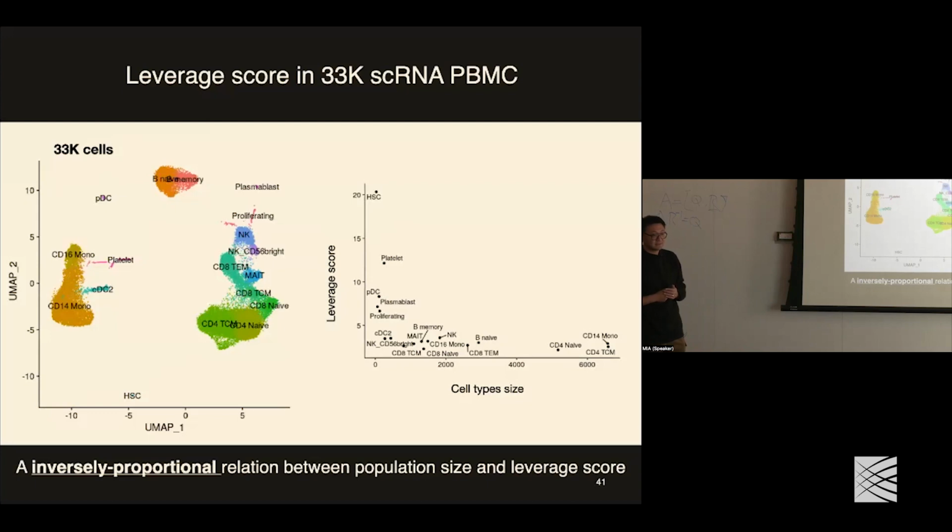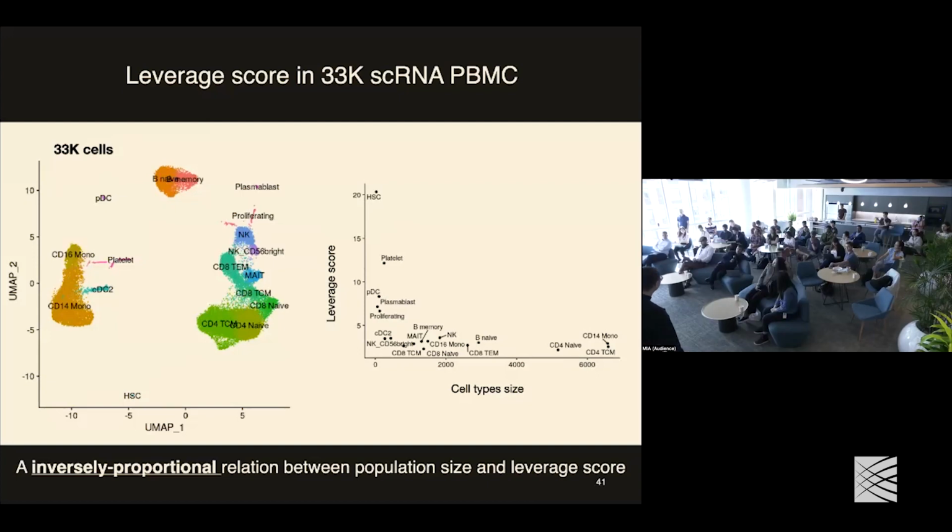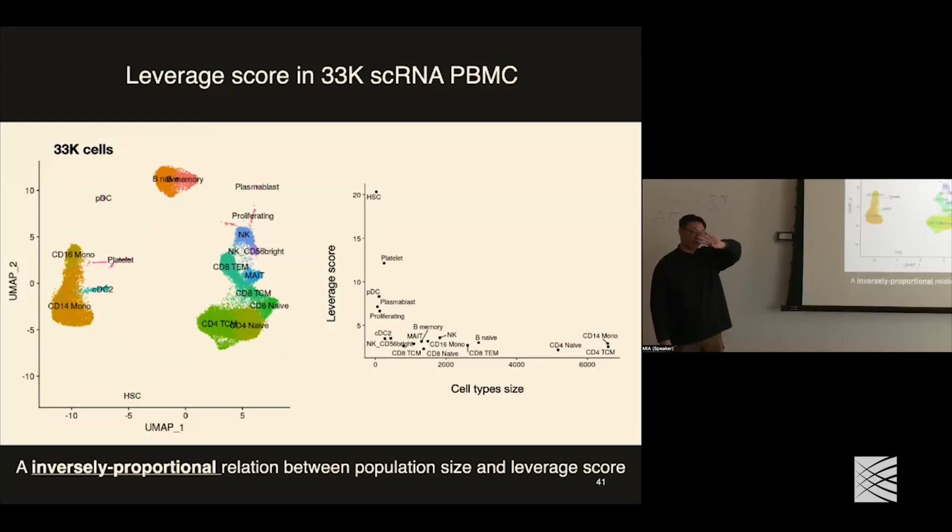So this data, I guess intuitively, is asking how the leverage score of a cell relates to the density of the cell. So, density estimation. Yeah. The leverage score is originally used for outlier detection. When we remove the outliers, there's a big change in the gene covariance matrix, or the feature covariance matrix, and that's why they can capture those big changes.